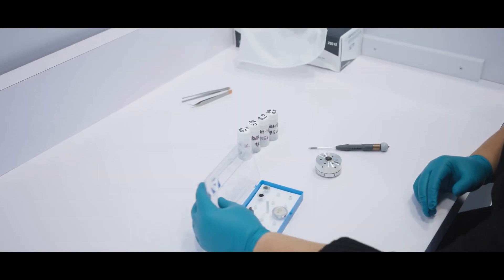These are quite difficult samples to measure with EDX because they're highly topographic and they have a large amount of inhomogeneity. They're chemically very complex — a mixture of 25 different oxides make up the glass itself. You really need a high count rate and a high throughput of your detector to get all those trace elements and to define all the elements or contaminants present in the sample.